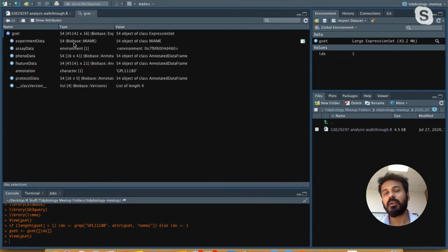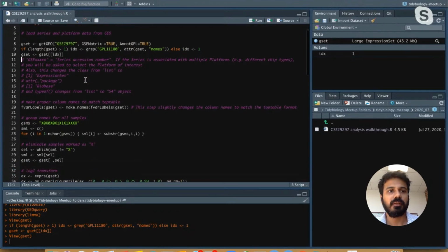Whether or not you've known this, you have previously used base types, and you've used S3 objects also, like factors. S4 is a more complicated object type in R that's used a lot by various Bioconductor packages. It's a really useful, standardized way of including a lot of different information in one object type. It's a little difficult to navigate or get used to, but once you get used to it, you see that there's a nice logic to it. So that's what line 10 does.